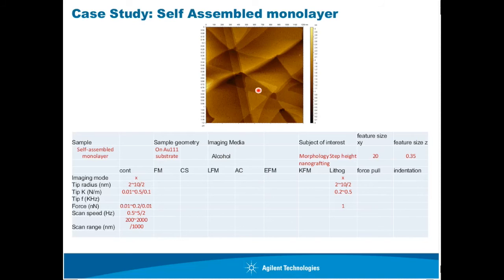You can also use this kind of sample to do lithography. You can cut a little symbol of yours using a very sharp tip, and relatively soft tips, slightly more stiff kind of cantilevers, and you can cut something that's very nice.